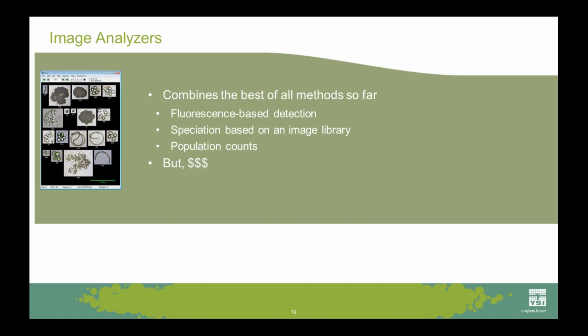I think tools like the FlowCam made by Fluid Imaging Technologies, which started here in the state of Maine in the United States, may be the future of algae monitoring. It appears that I'm not alone in that. Just this month, FlowCam was purchased by the Japanese company Yokogawa Electric. So I suspect that we're going to see some very exciting things happen with this technology in coming years. Hopefully, one of the things that might happen is the price will come down. This is still very expensive technology. It's really not yet well adapted for real-time continuous monitoring the way sensors are.